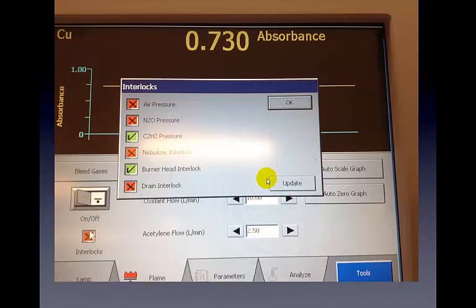Once we have optimized the lamp, the next thing we need to do is turn on the flame by tapping on the flame tab at the very bottom of the screen. There are several tabs: lamp, flame, parameter, and analyze. On the flame tab, you can see a small check box on the bottom left-hand side that says interlocks, and the interlocks box is checked with the color red.